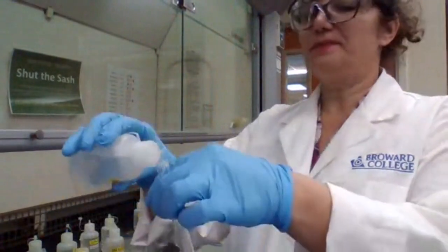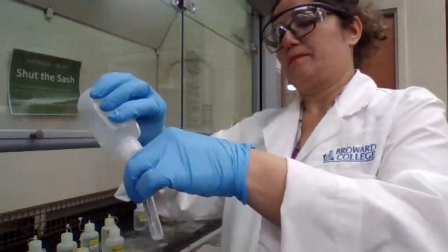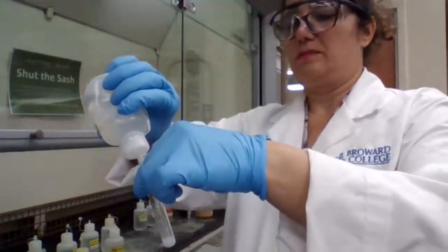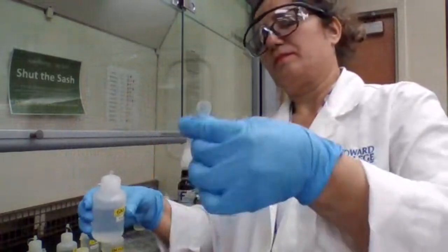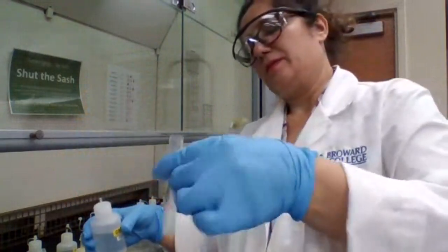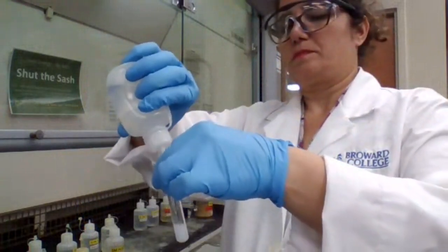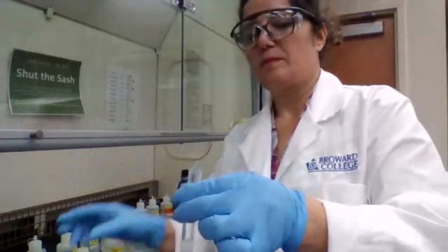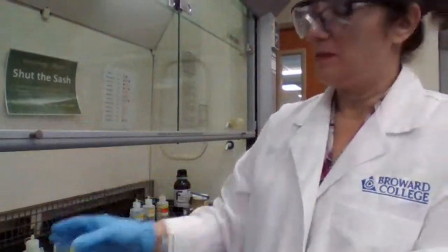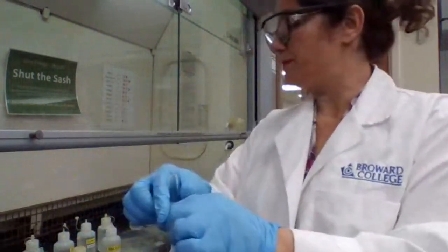So we're going to add 10 drops. 5, 6. Drops.